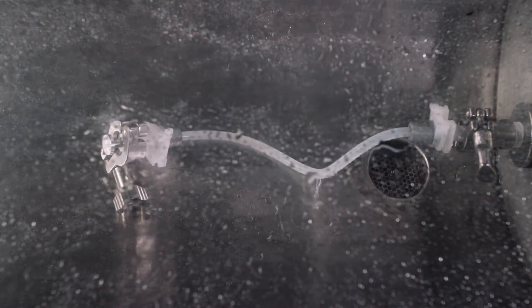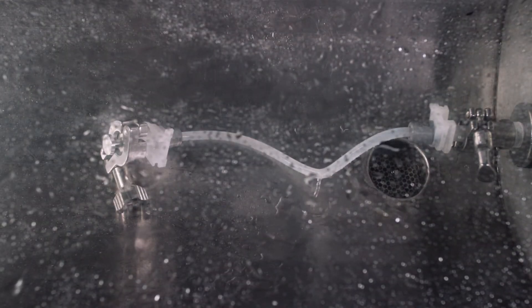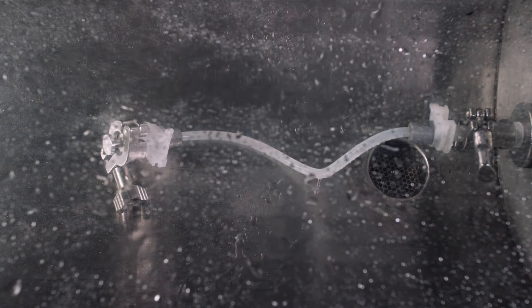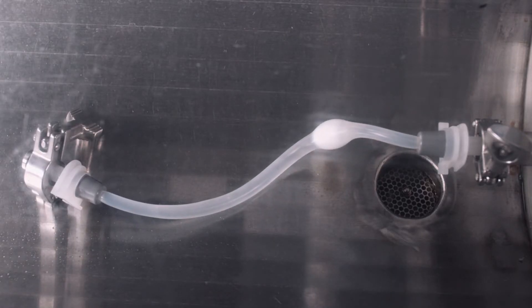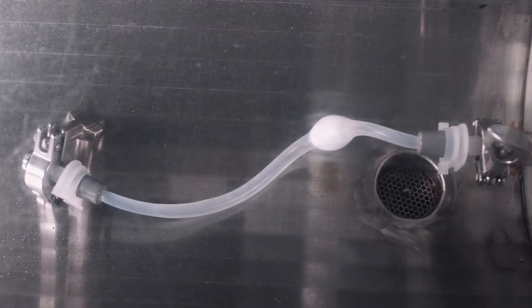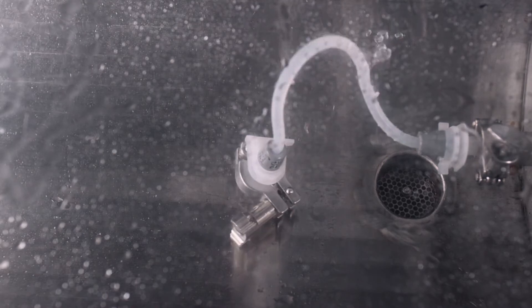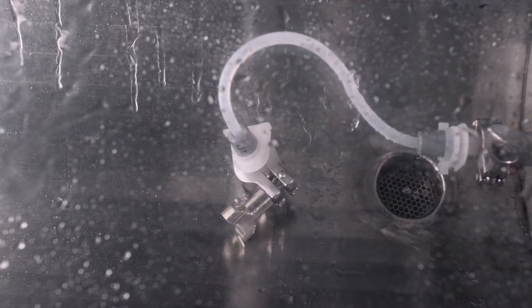Can your peristaltic pump tubing take the pressure? Are you putting your valuable drug product at risk?